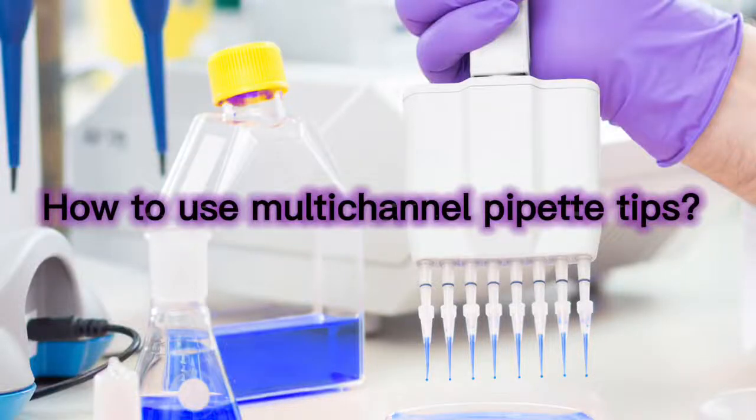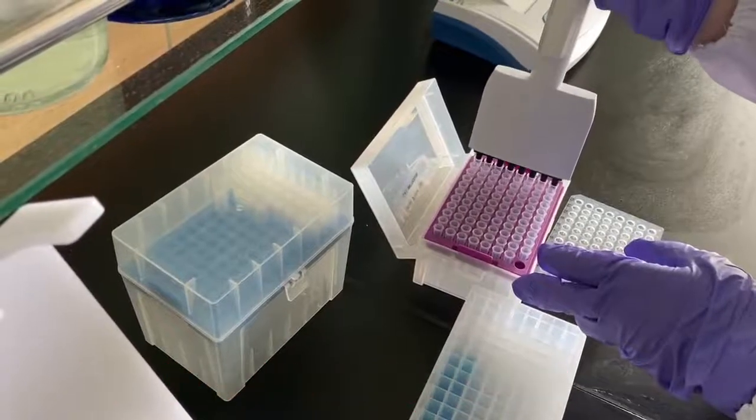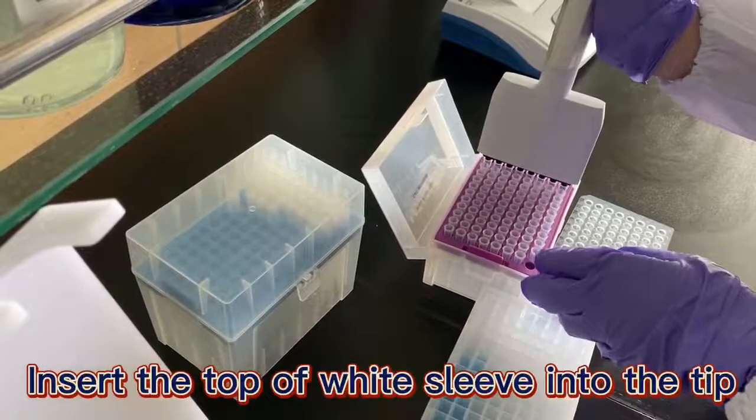How to use multi-canal pipette tips. Pipette tips installation: insert the top of a white sleeve into the tip.